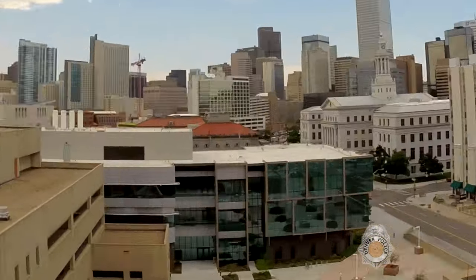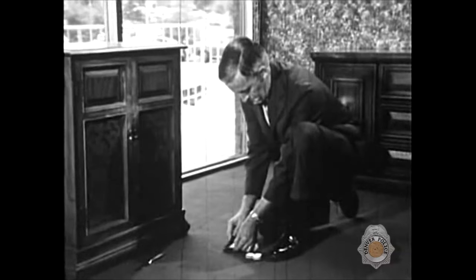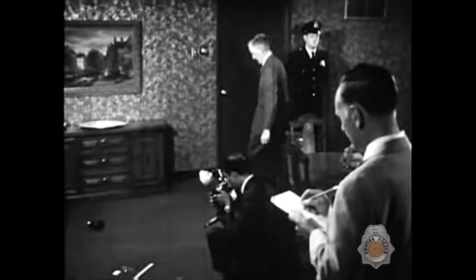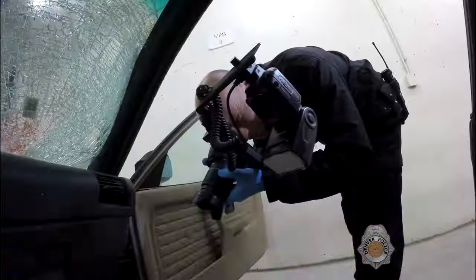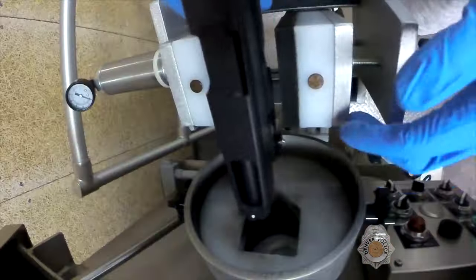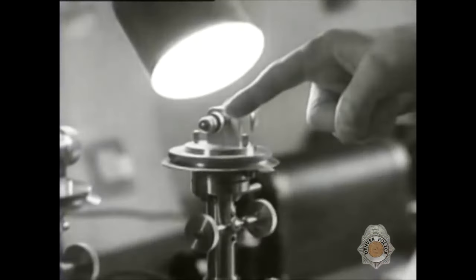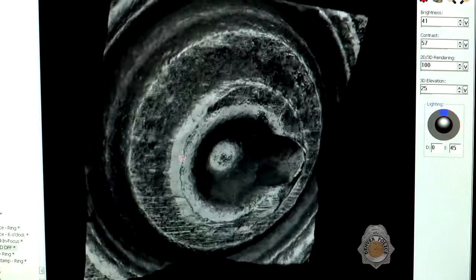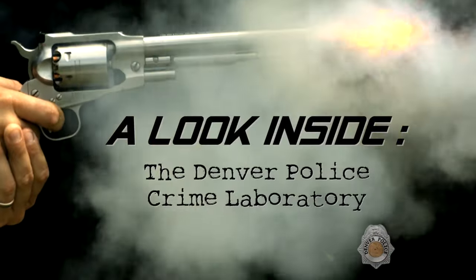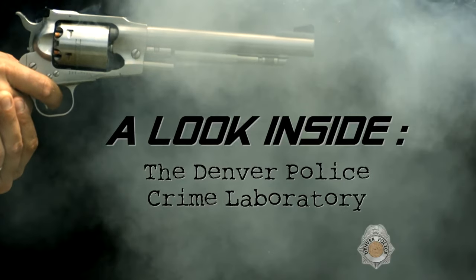Yo, check this out. When physical evidence is found, it is immediately photographed. These pieces of evidence are preserved for laboratory examination. Check this out! Here are dual microscopes, being used to see if two bullets are of identical make. It's weird science! They may prove innocence as well as guilt.